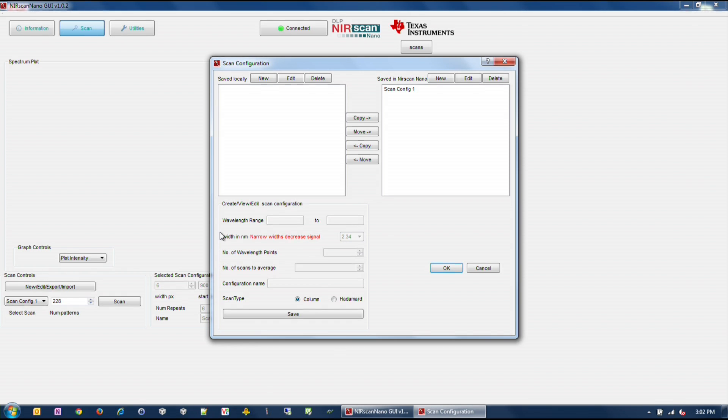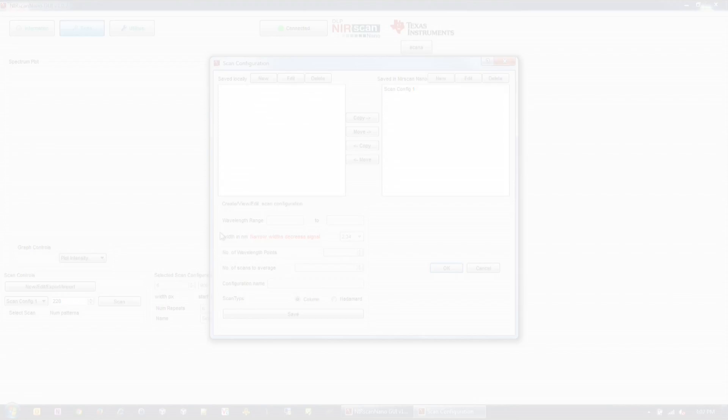Note the Nearscan Nano is optically designed for minimum resolution of 10 nanometers. The GUI allows smaller resolutions to be selected. This is for future customer specific optical designs with narrower slits.